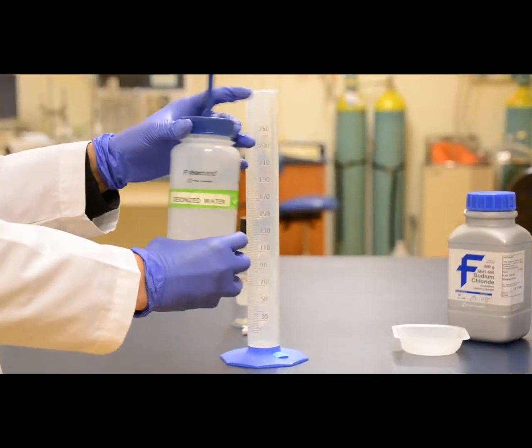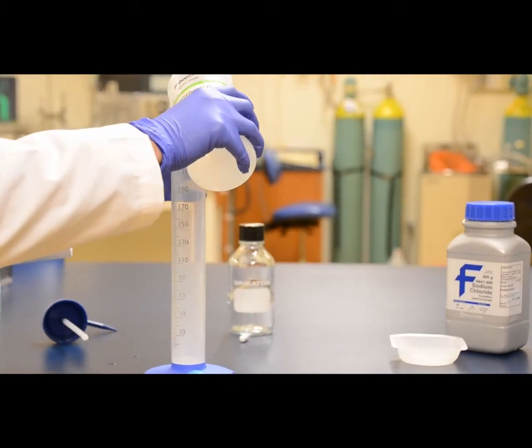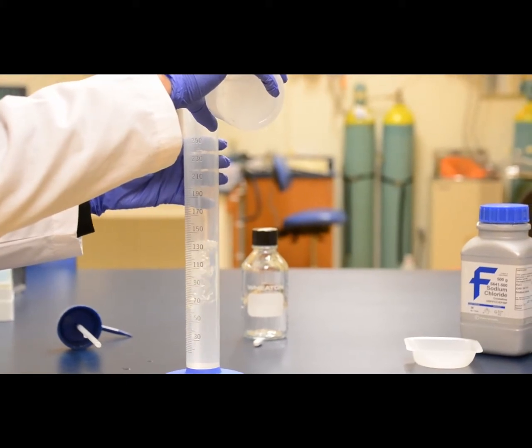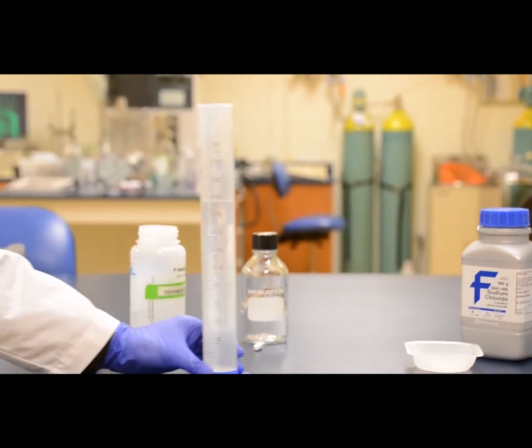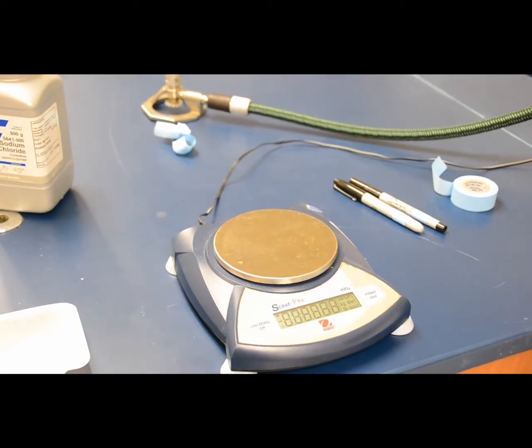Next, you want to take the smallest graduated cylinder you can fit your total solution volume in and add deionized water up to about 75% of the total final volume. In this case, I want to make a 250 milliliter sodium chloride solution, so I filled the graduated cylinder to about 190 milliliters. Next, turn on the balance and wait a moment for it to start up.